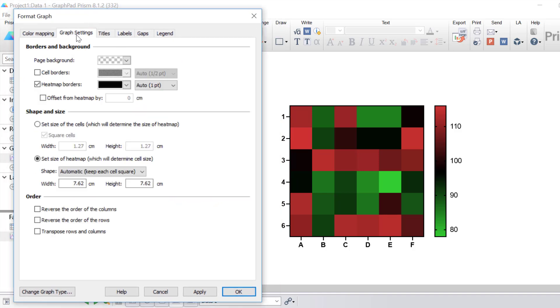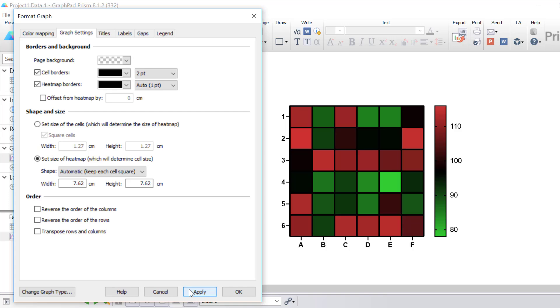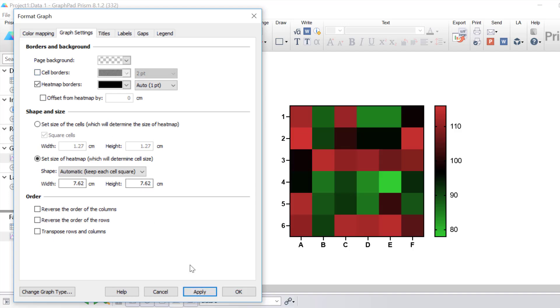In the next tab, Graph Settings, you can change the appearance of the borders and background of the graph. Specifically, the colour and thickness of the borders around each cell and around the entire heatmap. You can choose to have each cell have its own border and change the thickness. For example, if I make this a bit thicker, notice now that each cell has its own border. Usually in heatmaps, cell borders are not shown. You can also change the appearance of the border which surrounds the heatmap itself.